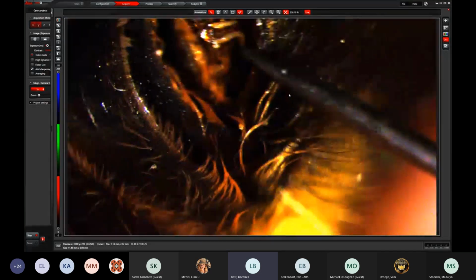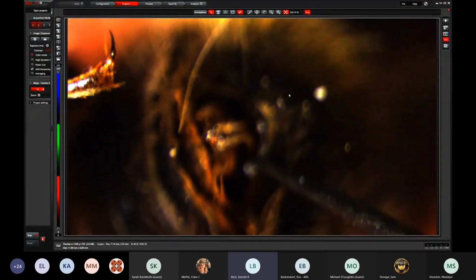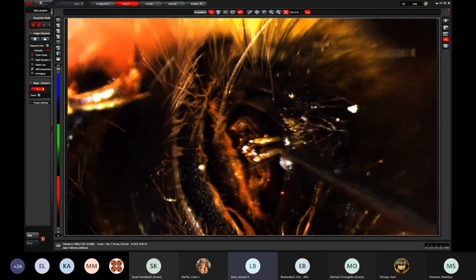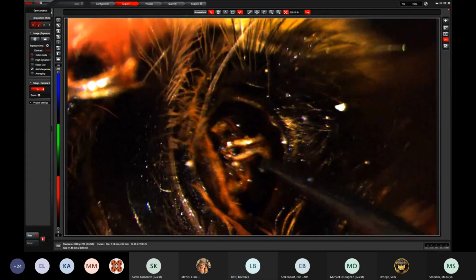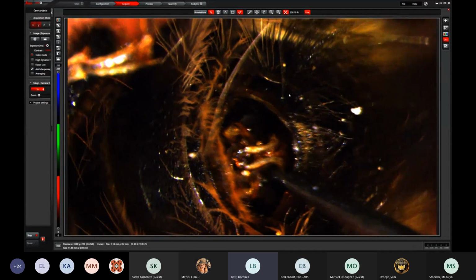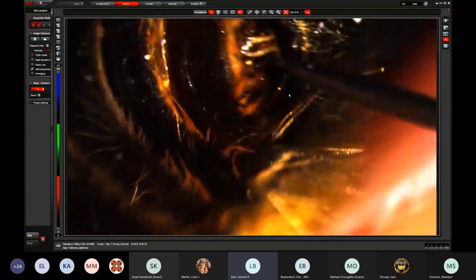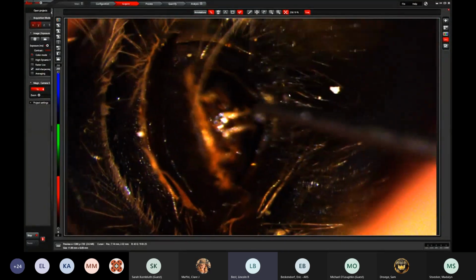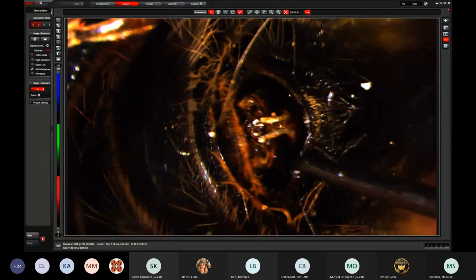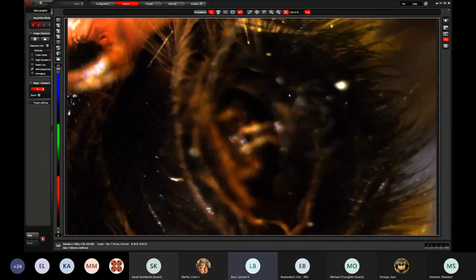And you can also tease that tergite around. Oh, I'm going to make sure I'm still on the screen here. To see whether those penis valves are straight, whether they have a process or an angle medially. Again, whether they're pointed apically or whether they are curved in or curved out. And so all the structures you want to see are right there, and I have not extracted that capsule.